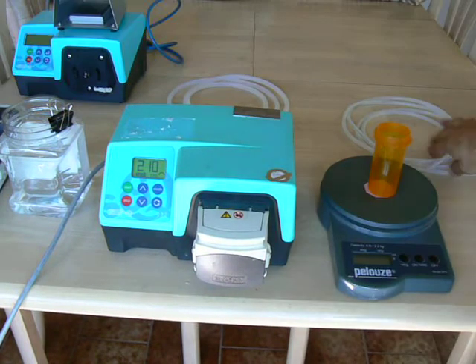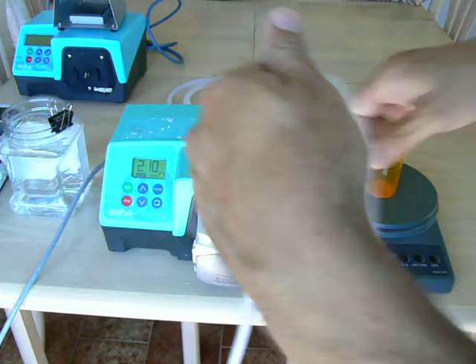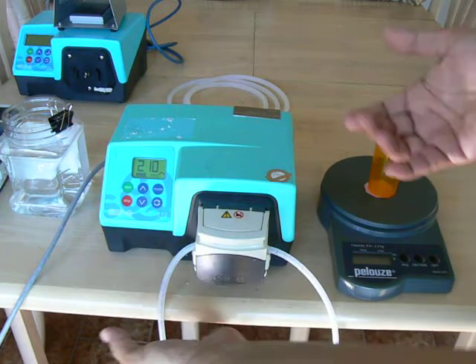This one's already been adjusted, so we're going to load the tubing. It's very simple — open the pump, lay the tubing across the rollers, and gently close the head. Now you're loaded.